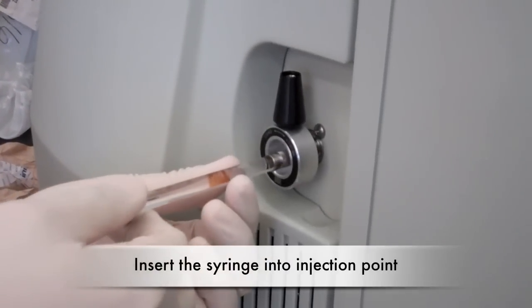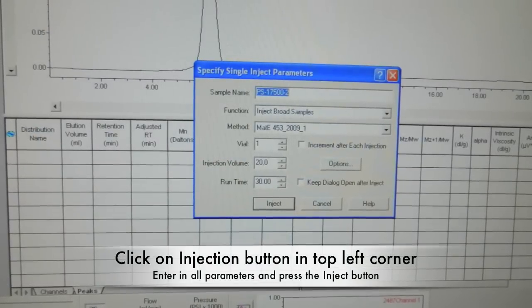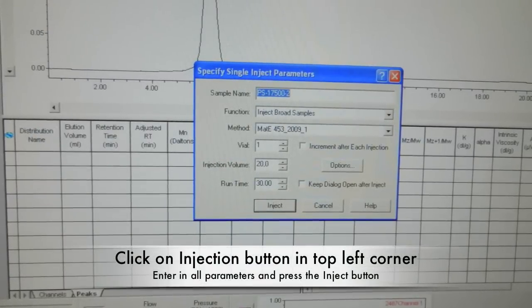Next, put the syringe into the injection point. Click on the injection button in the top left corner in the software and enter in all parameters, including the name of your sample.